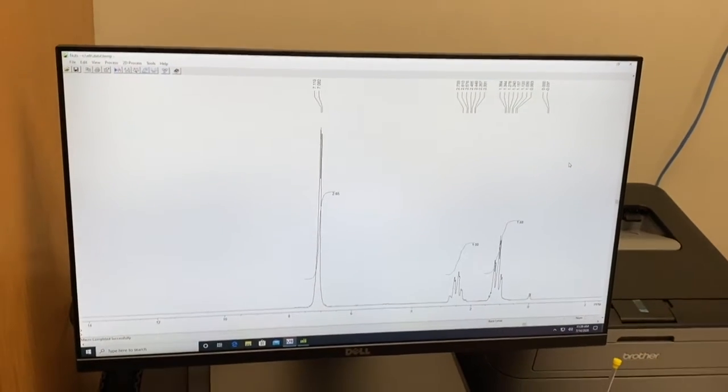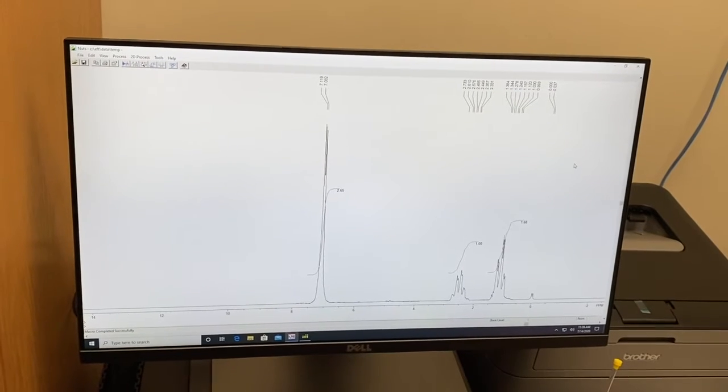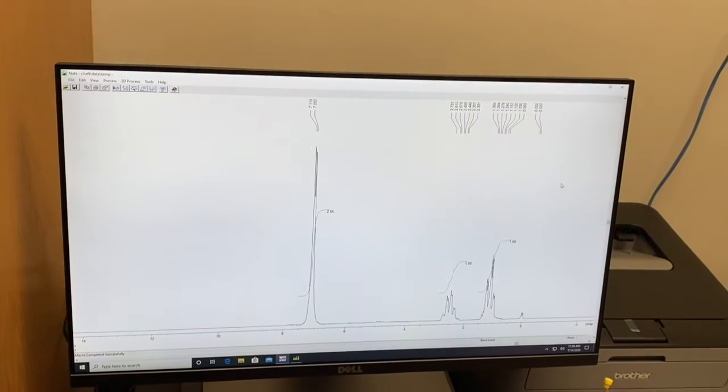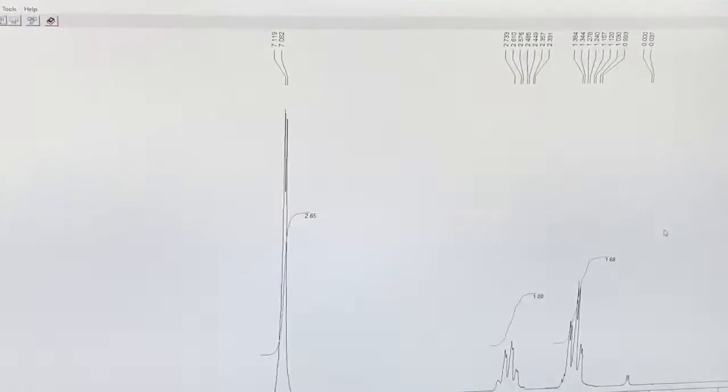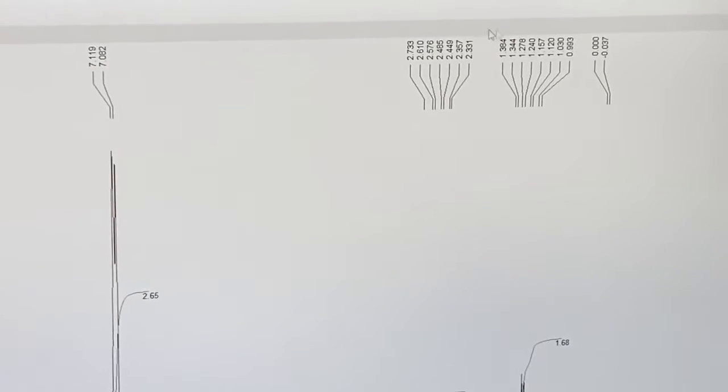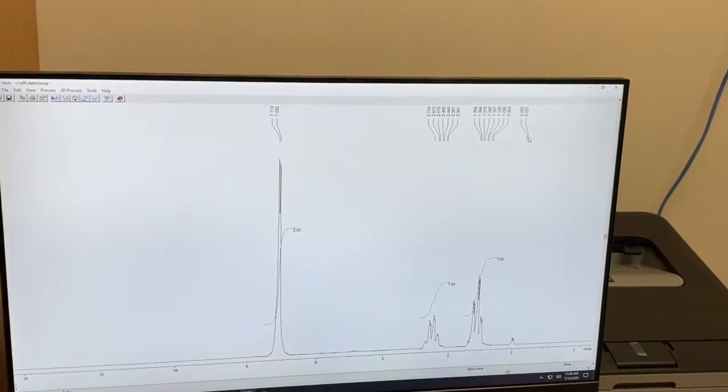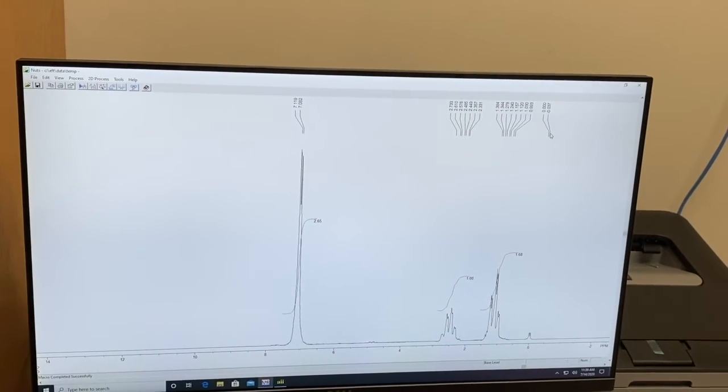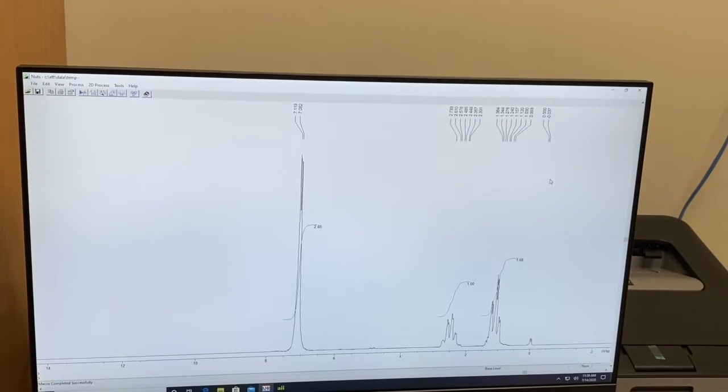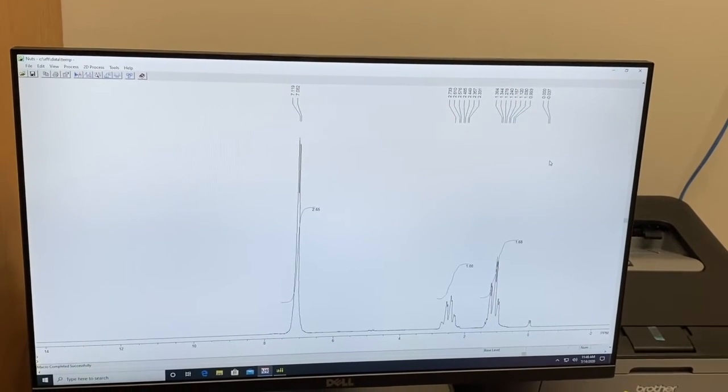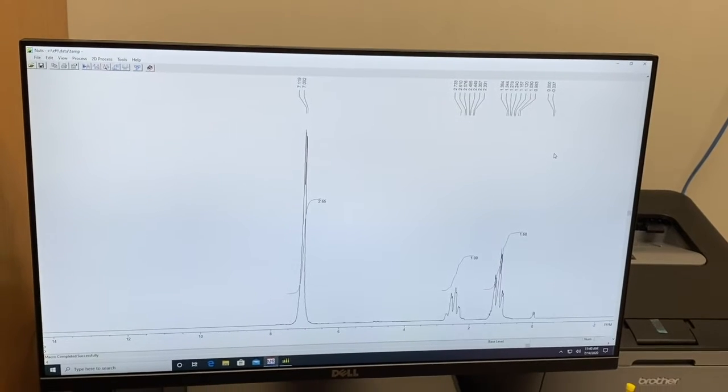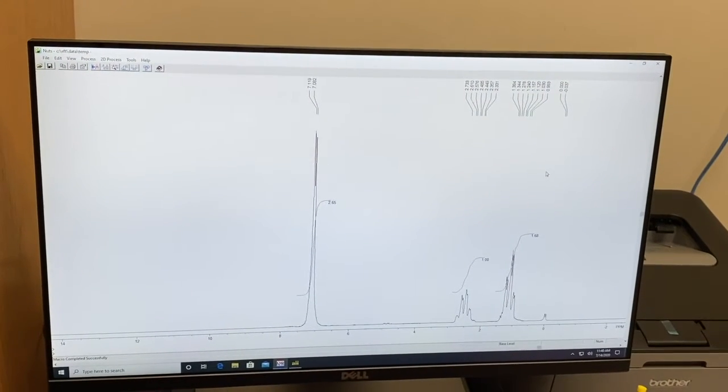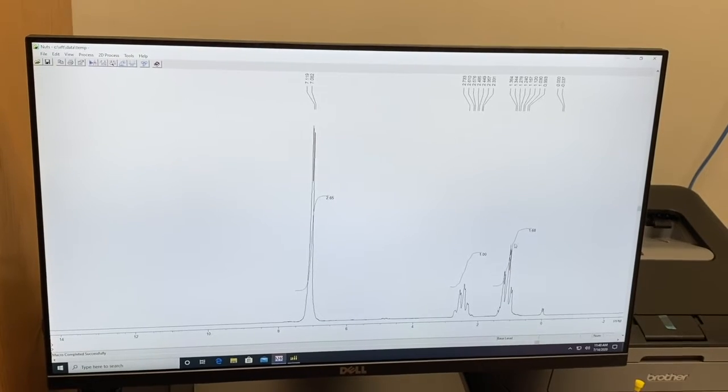In the instructions, the next thing it asks you to do is to label the peaks. You can see that they're already labeled. Those numbers are along the top. And so we're not actually going to do that since it's already done. But if you ever needed to, you could follow through those instructions. So we're going to jump down to doing the integrations. This one is integrated fairly well. We just have to adjust the numbers.